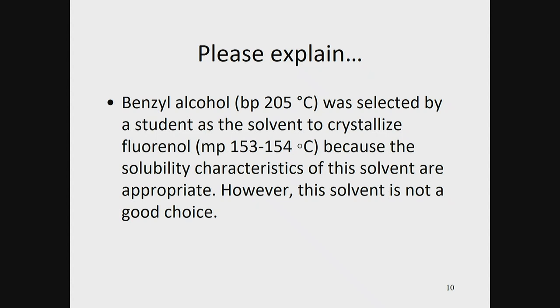It's going to be such a pain. This is a concept called oiling out. Oiling out is not helpful for us at all. And the second thing is, it's not mentioned in this slide, but remember, we do not want our solvent, in this case benzyl alcohol, to be reactive with the solid. In this case, benzyl alcohol is not going to react with fluorenol.